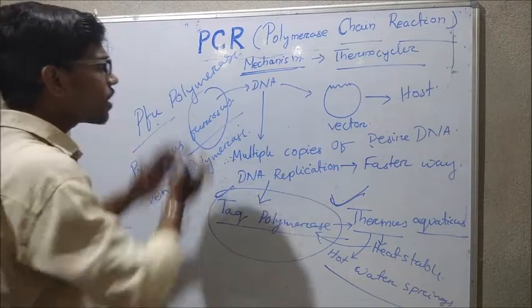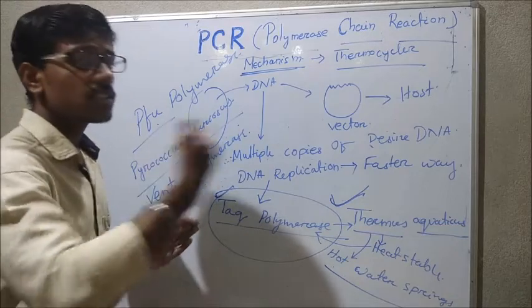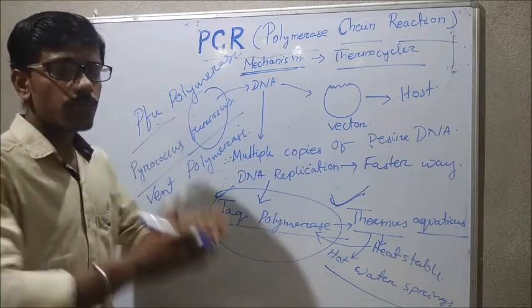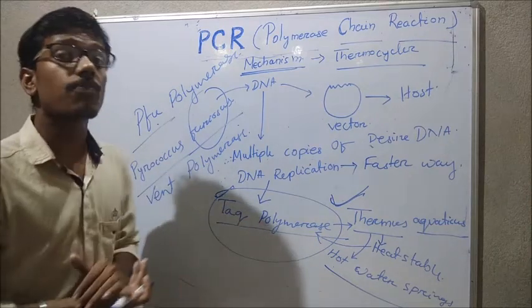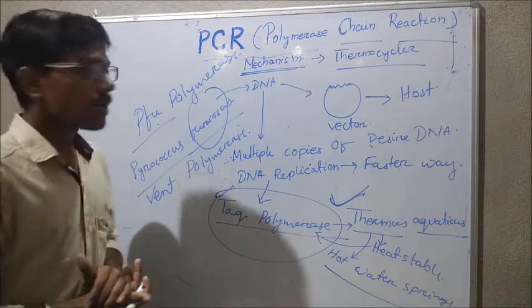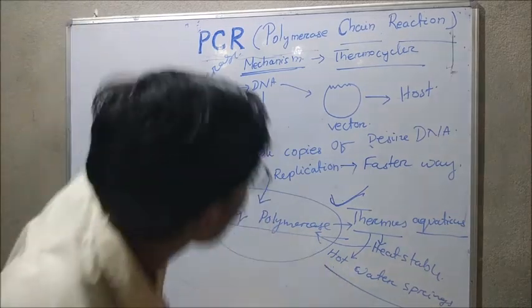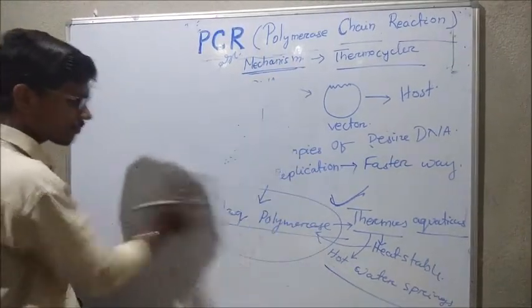Okay, so the PCR is basically dealing with repeated DNA replication. If we look at the mechanism, what actually occurs in the PCR or the thermocycler machine.